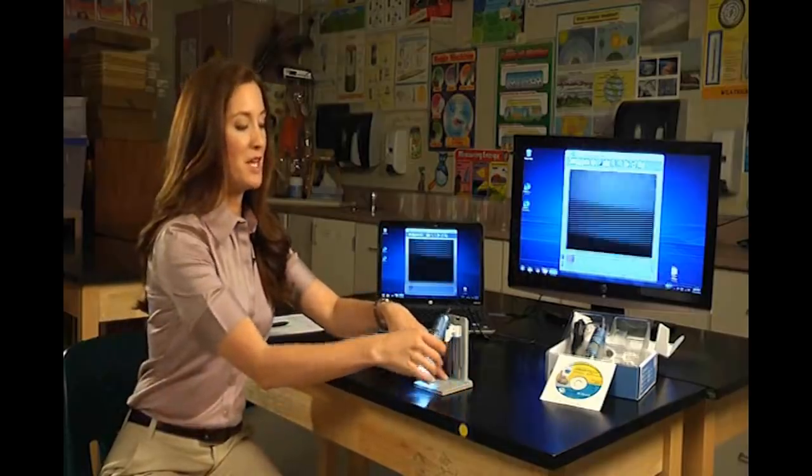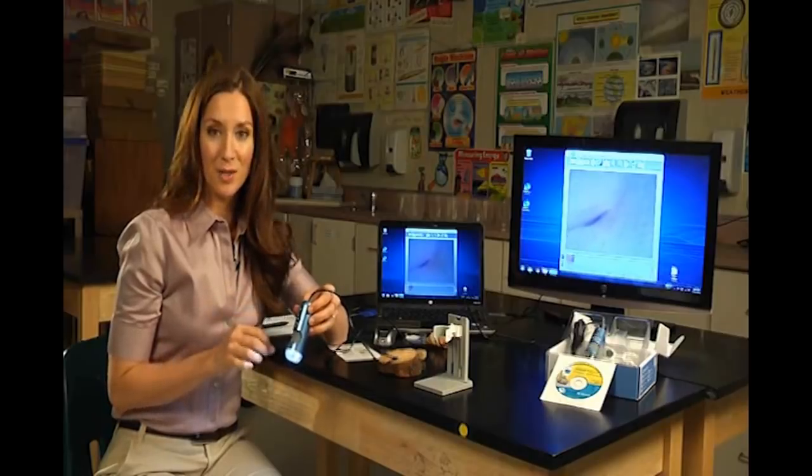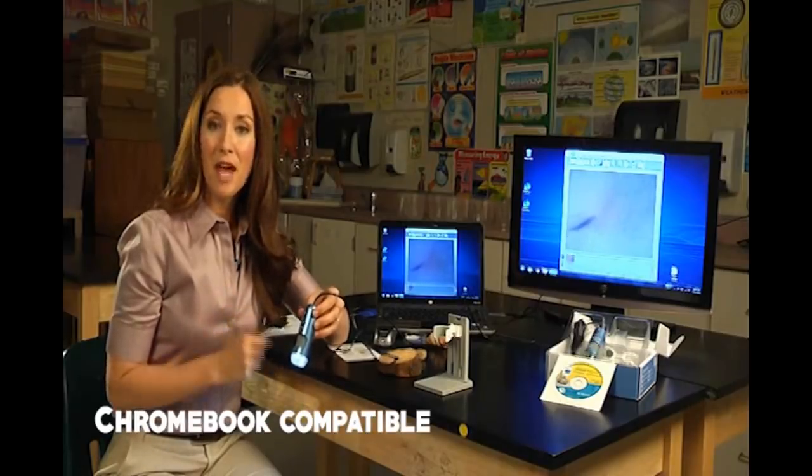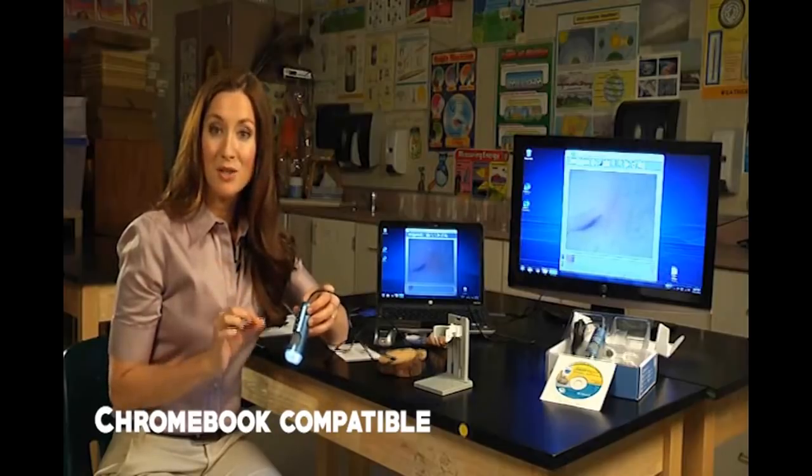The SmartScope 5M is a handheld digital microscope. What really makes this stand out is the fact that you get 5 megapixel resolution. This is great after you've captured a photo because it allows you to zoom in and really see the most minute detail.